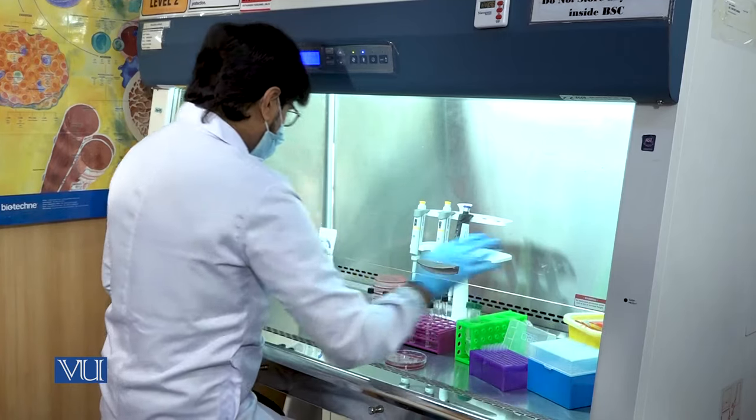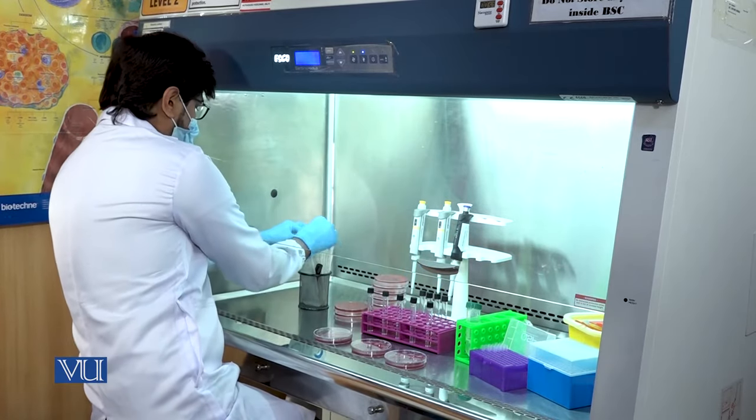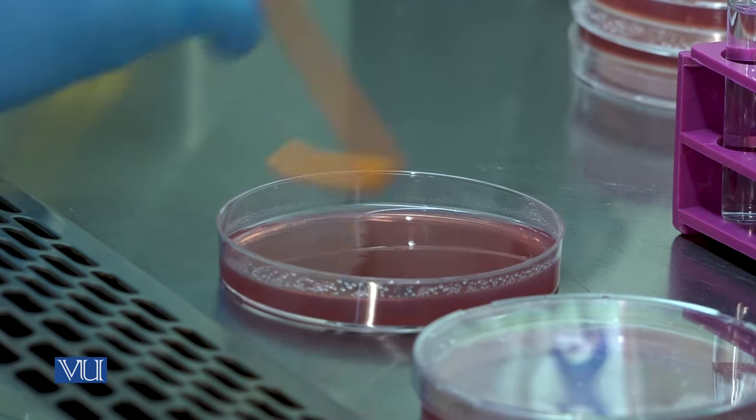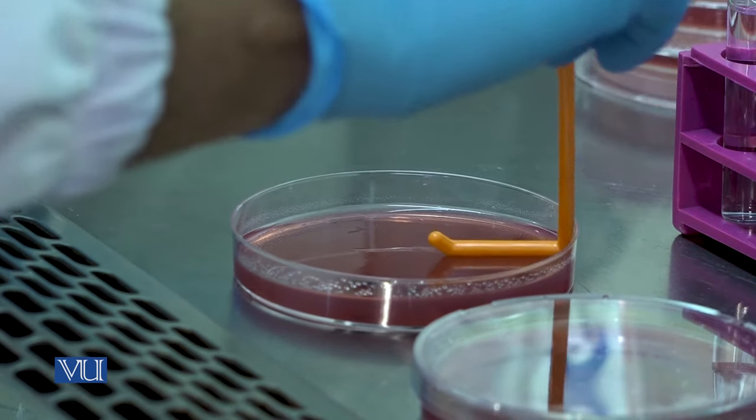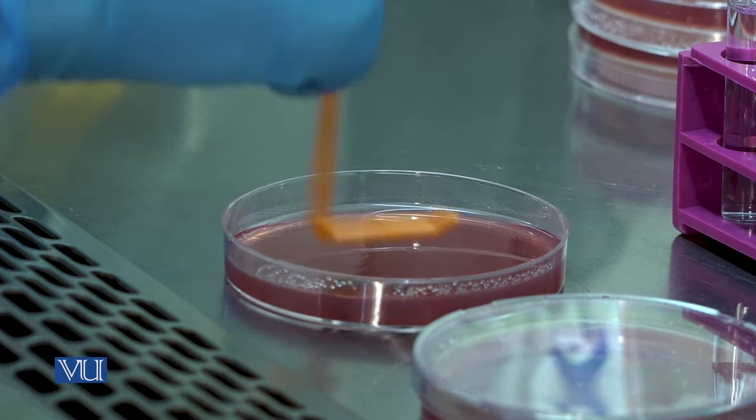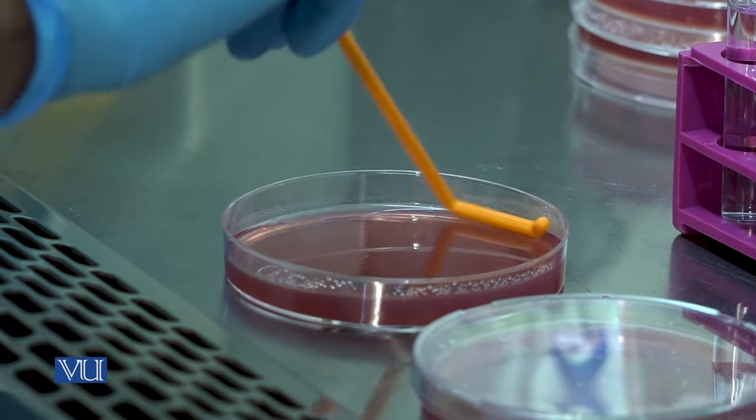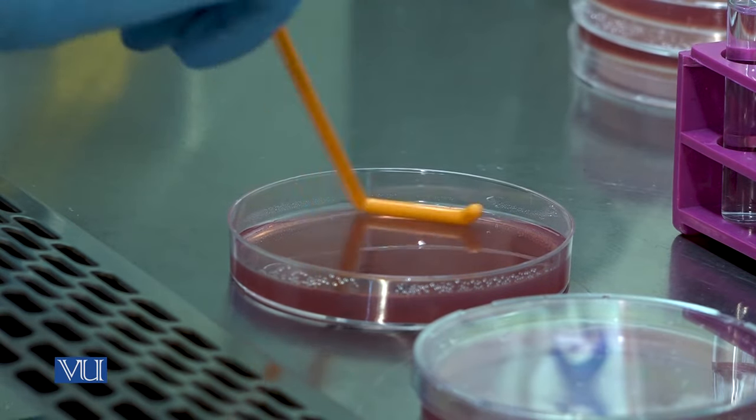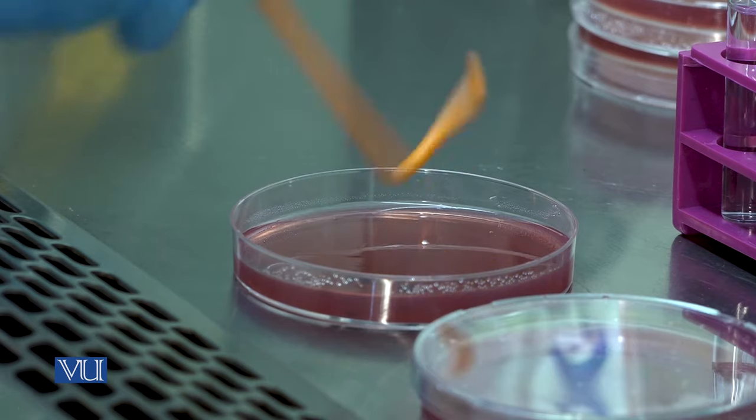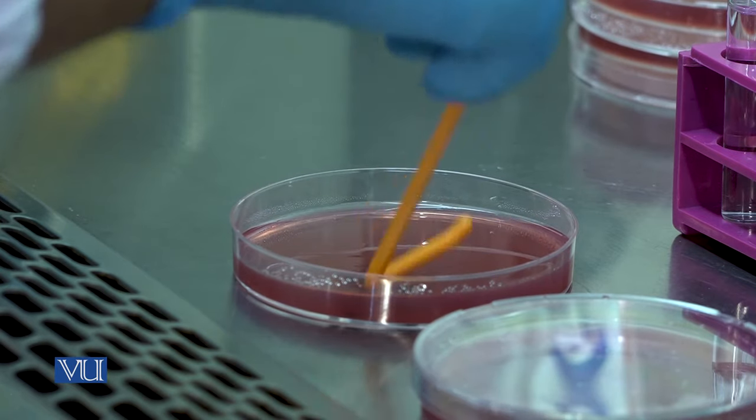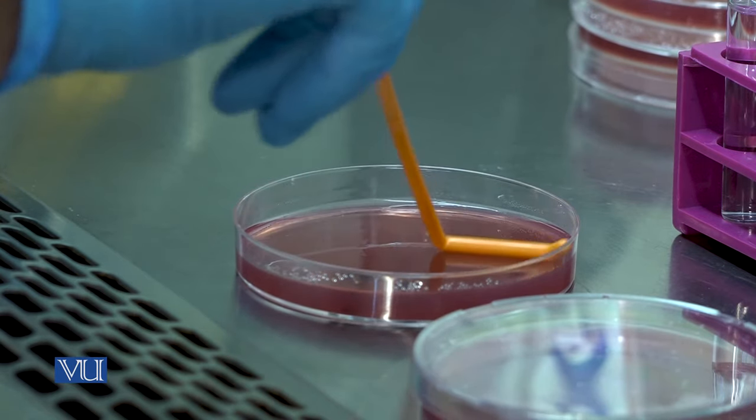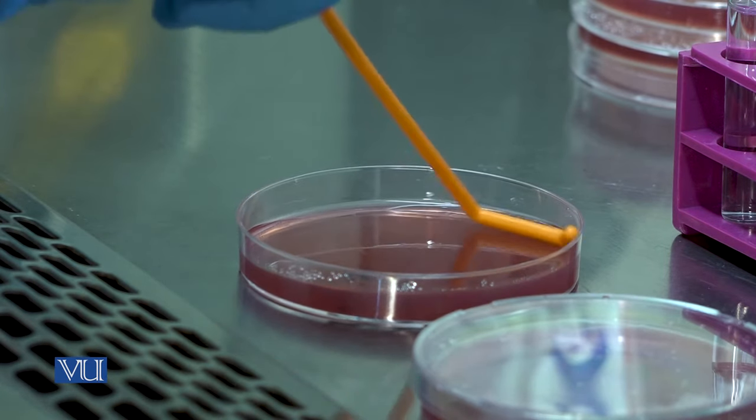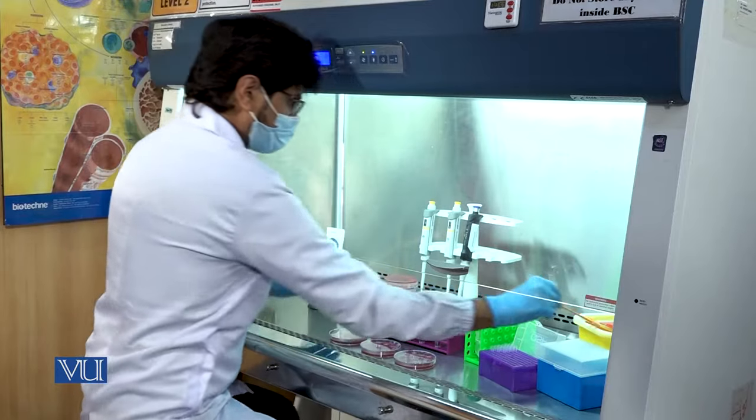Discard the spreader. Again, take out a new bacterial spreader and spread the third dilution in the third culture media petri plate until the solution is uniformly spread throughout the plate. Discard the bacterial spreader.